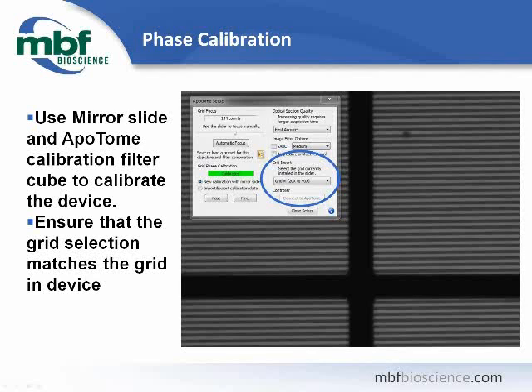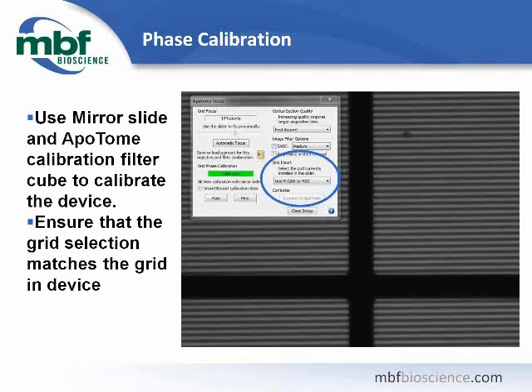Using the mirrored calibration slide that comes with your Apatome setup, first find the crosshairs and focus on them. This ensures that you are focused at the very top of the slide and ready to begin the calibration routine. When you have brought the grid lines into focus, you are ready to run the phase calibration. In this sample image you see a nice high-contrast grid pattern on the screen. Make sure you have selected the grid which is currently installed in your slider and click the Fast button on the lower left of the Apatome dialog.